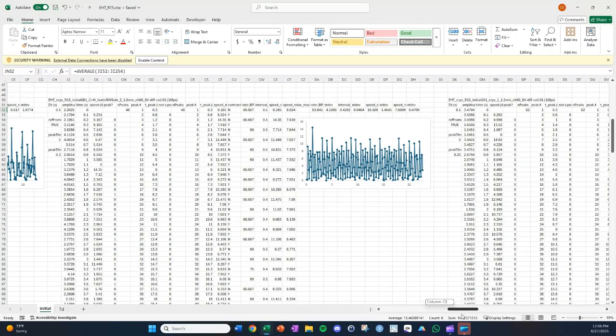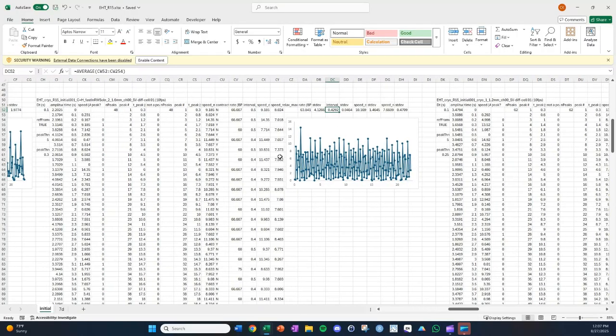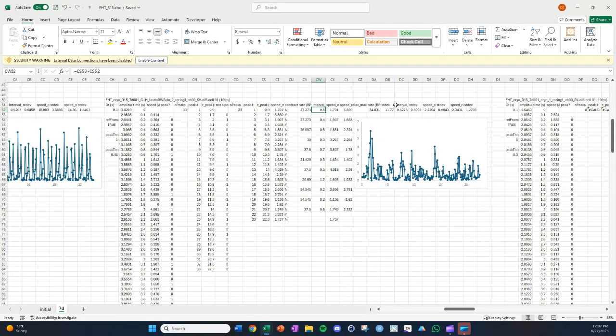So this one got a shorter interval. So here the interval value doesn't look that bad to me. Looks pretty reasonable, consistent with that. Though keep in mind this is the interval between contraction and relaxation, and right now it's reporting the opposite.